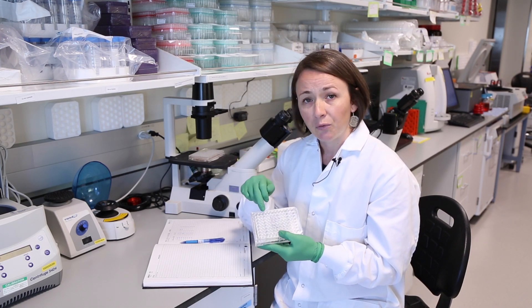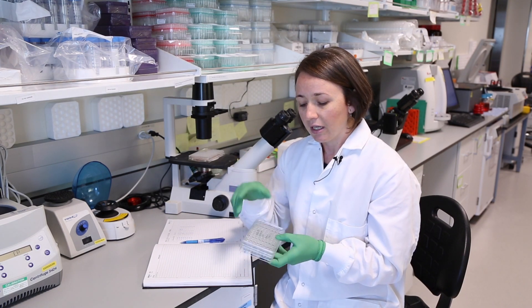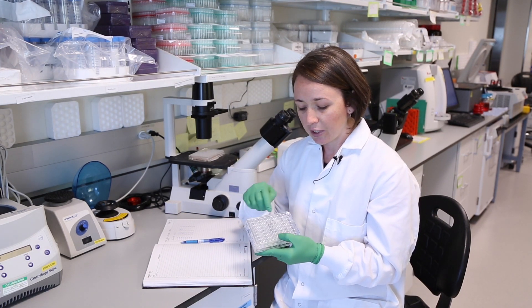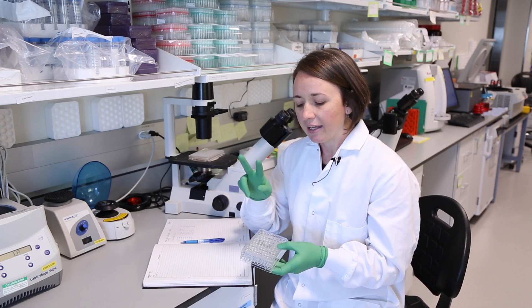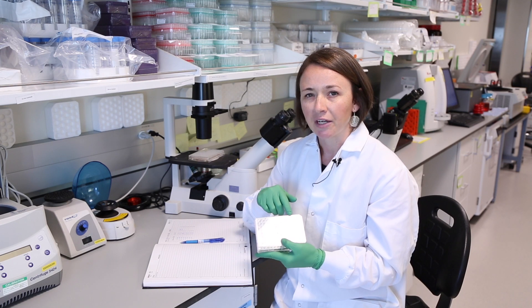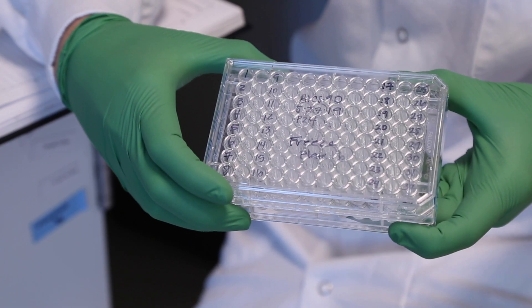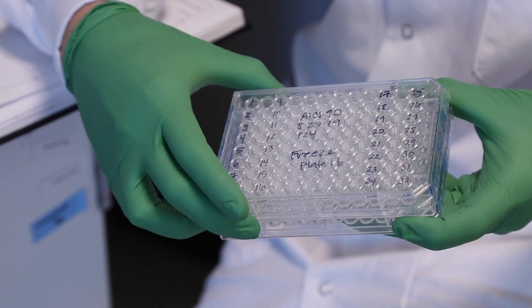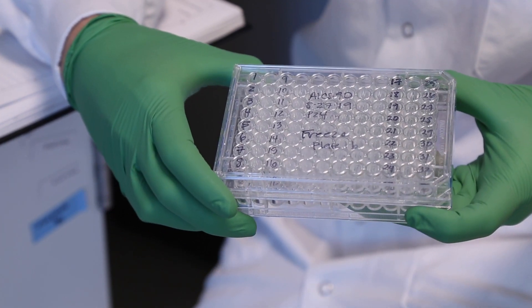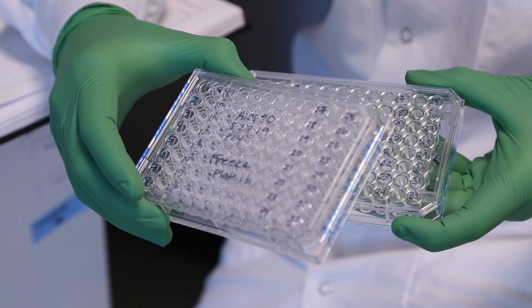I like to only put four columns of cells per plate, and that's for two reasons. One, it helps to have the cells spread out across the plate because they thaw faster when there's space between them. Second, this is about as many columns as I would actually recommend passaging the cells at one time. We also recommend having two replicate sister plates of each freeze plate, so that you have a safety net when you thaw the cells. If you end up thawing one plate and need to go back to the other one, you still have it in the freezer.